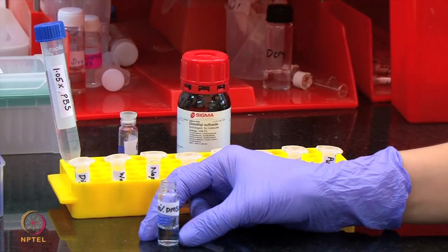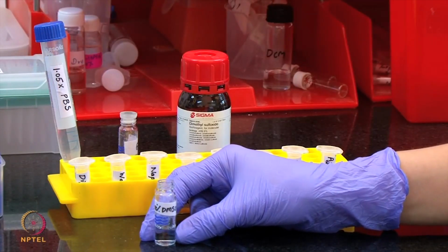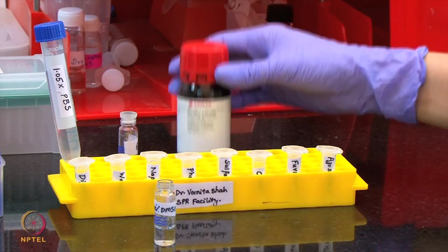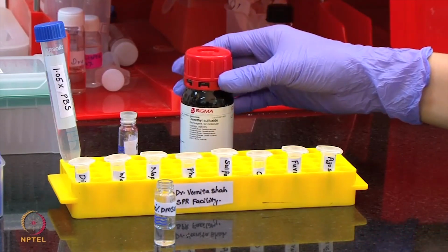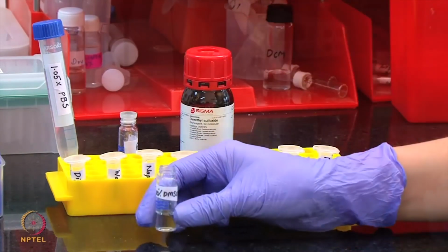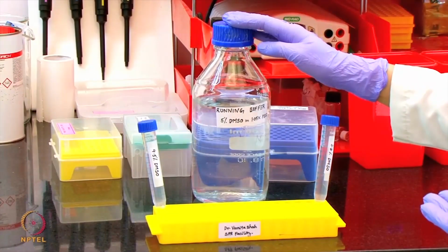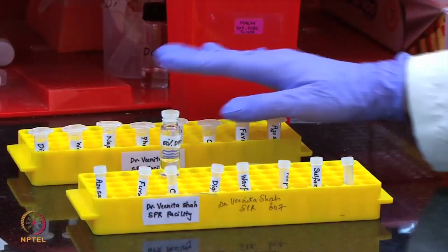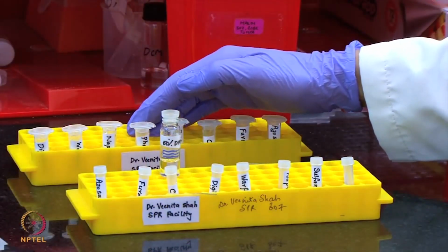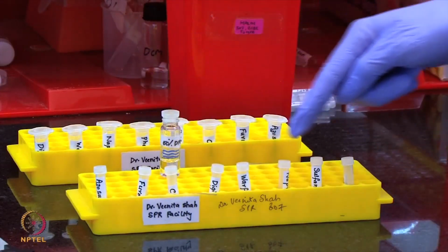For washing, we have also prepared 50% DMSO in water using 600 microliter of DMSO and 600 microliter of water in a 16 mm vial. Running buffer will also be used as negative control in this experiment. All of these samples and reagents have now been allocated in the required volume in these specialized tubes.